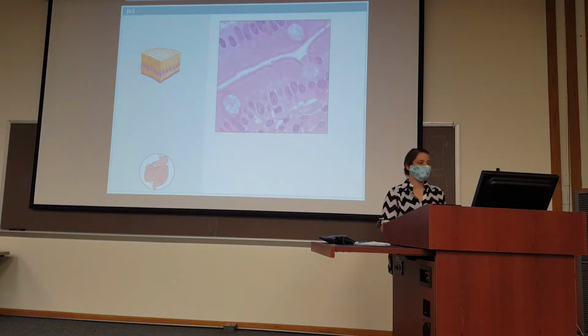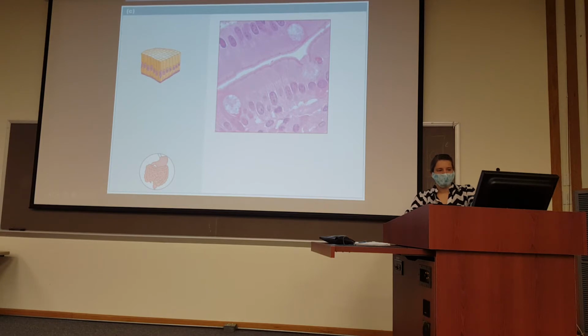Okay, this type of epithelial tissue shows up a lot in your digestive tract. What is it? Do you see the shape here? Oh, sorry, I'm doing the teacher thing where I feel like I should ask lots of questions. Okay. You've got connective tissue down here that's supporting it, right? It's only one layer thick, and it's nice and tall. What kind is this? Simple columnar. Nice. Sneaky tricky question.